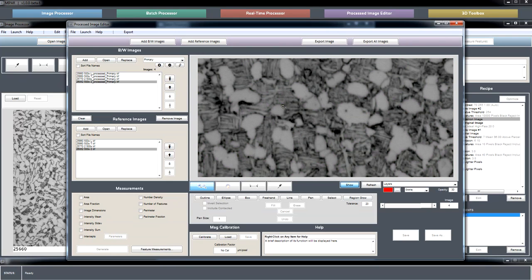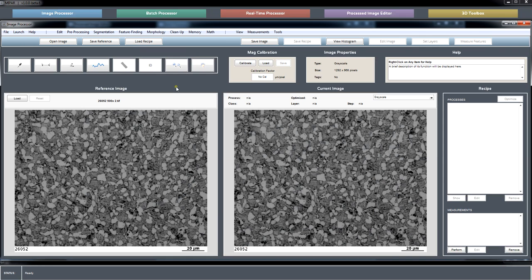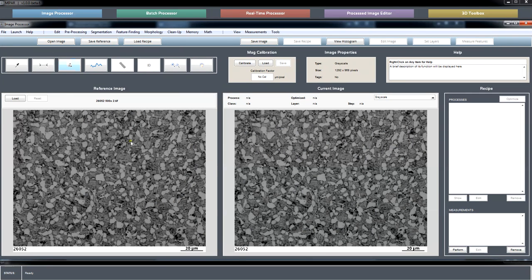So you could sort your images into ones with strong alpha beta contrast that you intend to measure lath thickness from, and others with weaker contrast. These weaker ones, if you're just after primary secondary fraction, or if, I hope this applies to enough people in this webinar, this can be an example, and I think it would work for some of the other examples that were submitted.